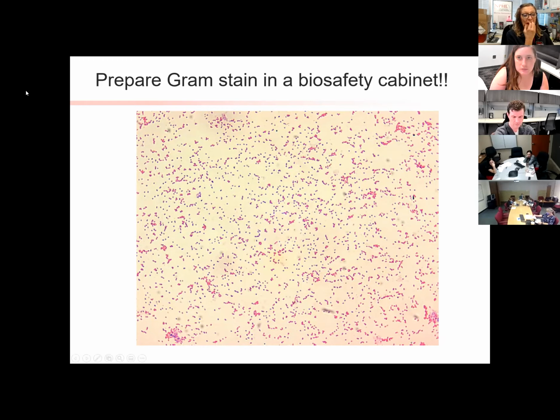Yeah, this is a tough one because you're really not sure if it's gram negative or gram positive. Is it coccobacilli? Is it diplococci? Is it a small gram negative rod? So really, it just shows that your answers are kind of across the board, and that's just what it's going to be. However, think back to our last gram stain. That one was so tiny, we could hardly tell if it was specks of sand or debris or whatever. Here, we actually see organisms. We see individual cells. Some of them might look cocci-like, some of them look rod-like. So I think you are right to say coccobacilli and report it out as gram variable.